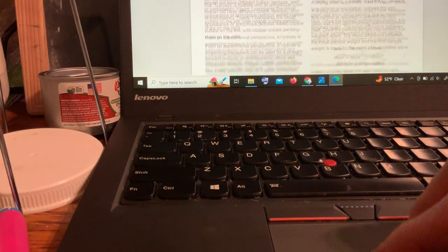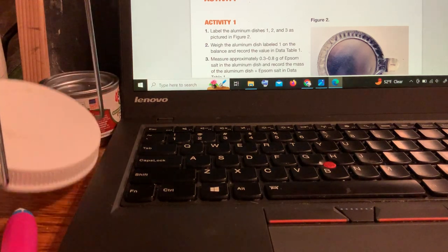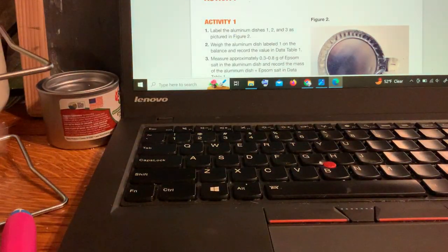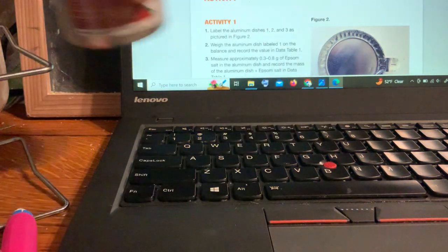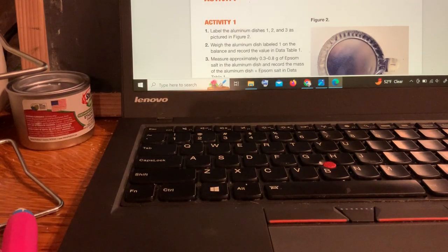Here's what we are doing today. You're going to use part of your home kit that has this stand in it. There's a bag in there that has this stand and several pans, this bag of Epsom salt, and this Sterno can for heat. This is the same kind of heat we used in the flame test experiment. You're also going to need to use your electronic balance again.